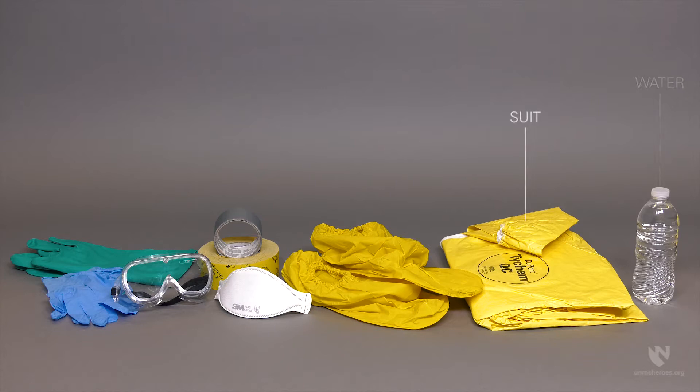The suit support personnel will need the following equipment: water, a suit, outer boots, a respirator, chem tape or duct tape, goggles, inner gloves, and outer gloves.